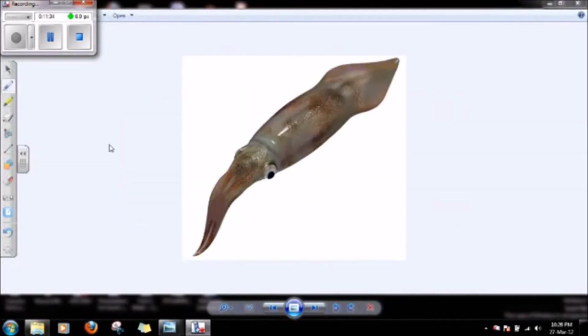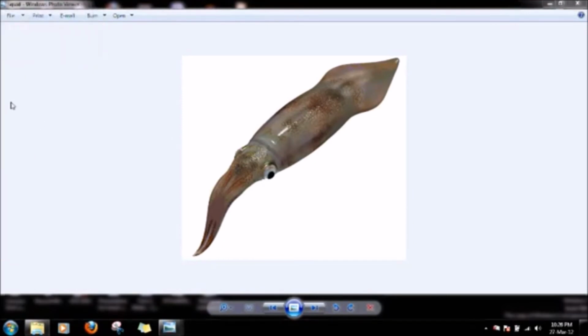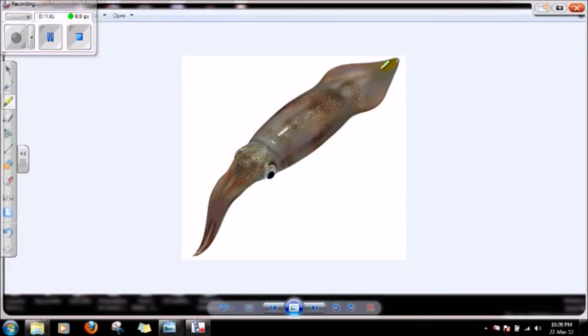Last but not least, after you've finished dissecting the internal part of your squid, turn your squid over and look at the dorsal side once again. You may be able to remove the pen. I'm going to highlight where the pen is on this squid. Here it's running along the back of the squid, and it serves like a backbone, but it's made of cartilage, so it's very soft. What you need to do in order to remove it is make a small cut right here, and then using a pair of tweezers or forceps, or your fingers, pull in this direction, and you can remove the entire pen, usually in one big piece.